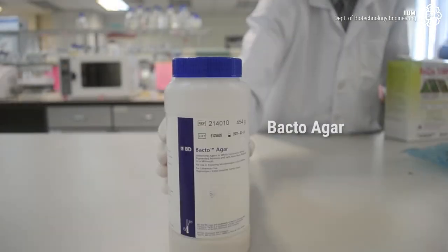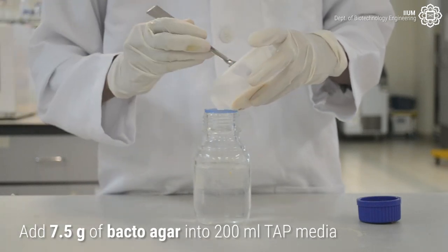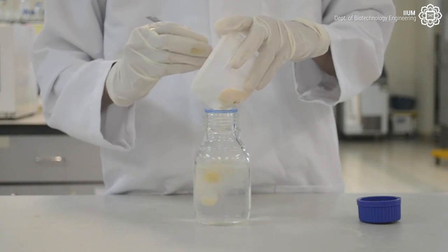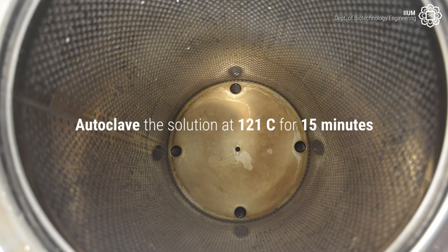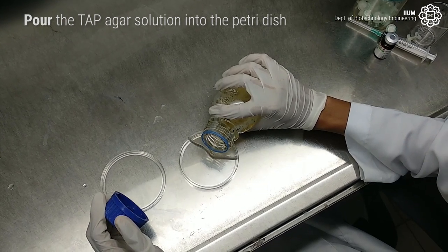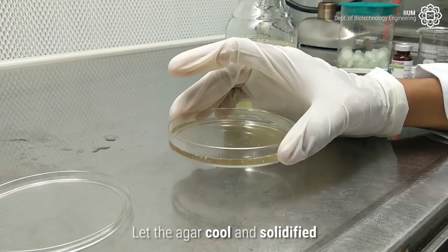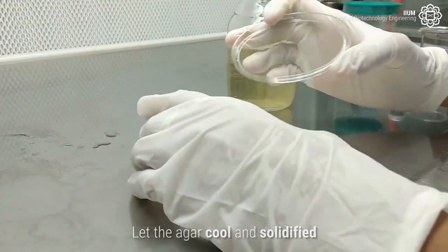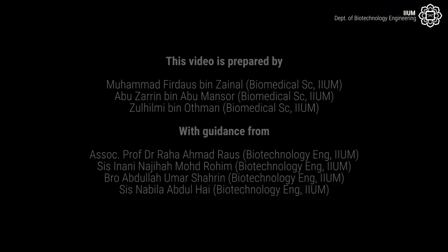Now we need to add the agar into the tap media solution. First, add 7.5 grams of bacto agar into 200 millilitres of tap media. Shake the bottle to mix the solution. Pour the tap agar solution into the petri dish. Let the agar cool and solidify.